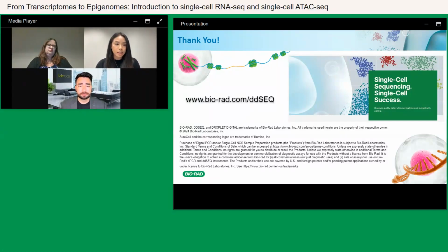With the single cell ATAC-seq, it's a little bit different because, like I mentioned, we have a separate step for nuclei isolation and tagmentation. With the nuclei loading being at 500 to 10,000, you want to make sure that you have enough cells for the tagmentation process to happen. With that, we require 60,000 cells or nuclei.